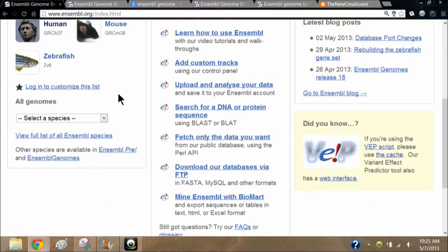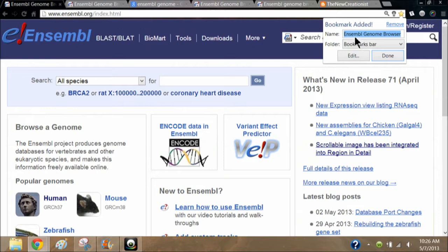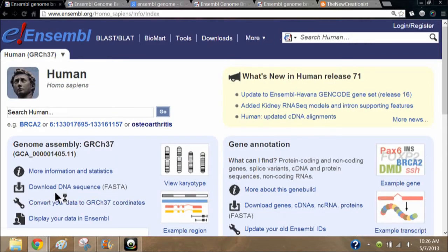Once you get to the site you can bookmark it if you like. We're going to begin by clicking on the human genome as a starting point. From here we can enter something into the search bar, or you can click on one of the items below, which are just examples of what you could enter.